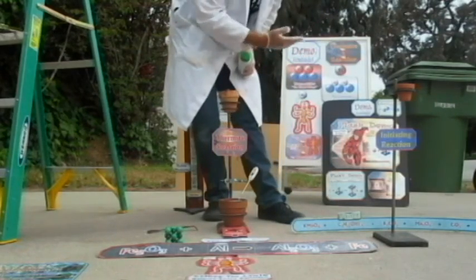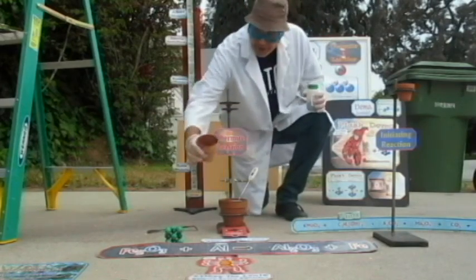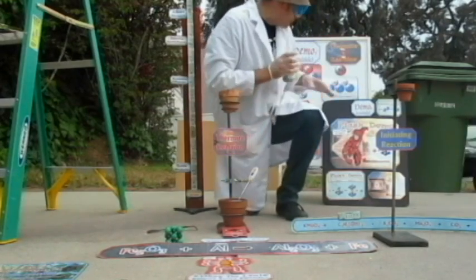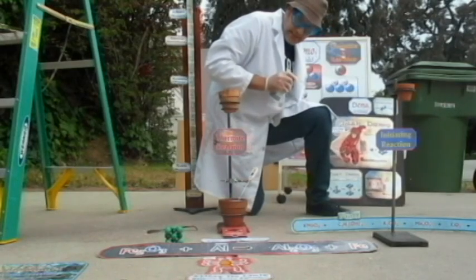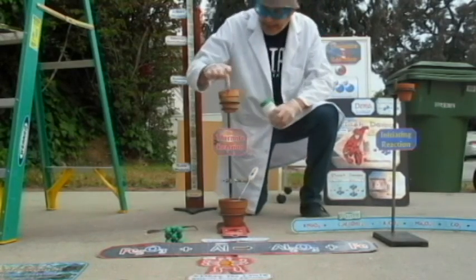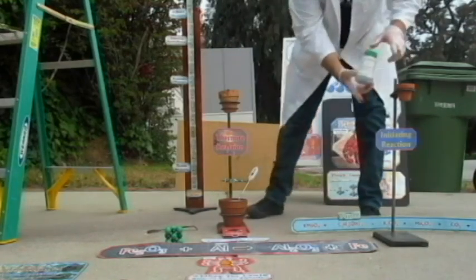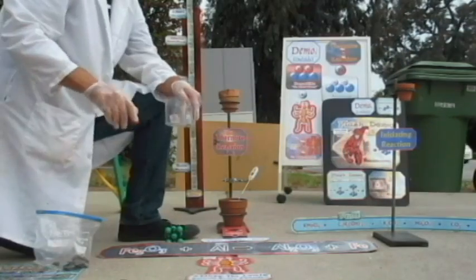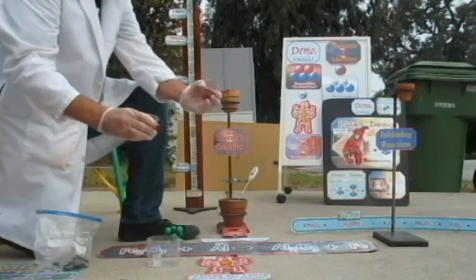We're by a busy street, so it's a little noisy. We're going to start off the thermite reaction in here using the flash demo. The flash demo is going to start it off. Flash demo is magnesium with silver nitrate. So that's going to be something I'm going to add in here on top of this. So right now inside this one we have potassium permanganate.